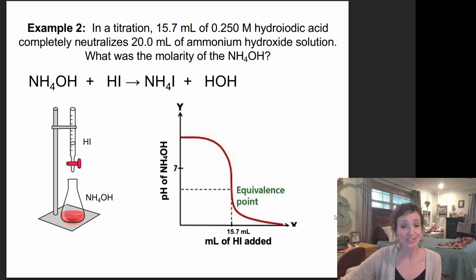So what I would want you to look at is based on what you're visualizing, meaning who is the titrant and who is the analyte. You would know whether it's going to slope down or slope up, okay? The pH of my analyte is what is measured, meaning I'm measuring the pH of the sodium or ammonium hydroxide throughout the course of titration, okay? Which means if it is a base, that is going to start off basic at the start of titration.